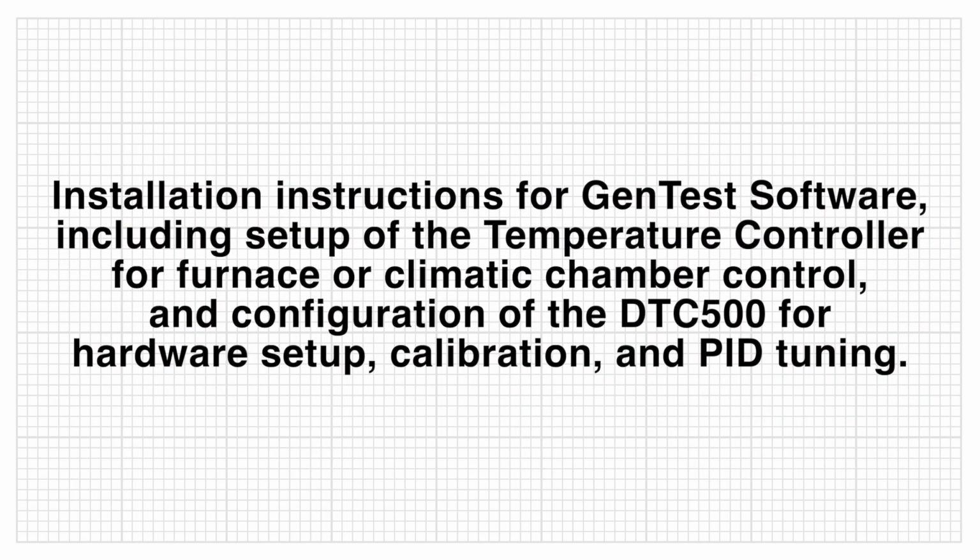Installation instructions for GenTest software, including setup of the temperature controller for furnace or climatic chamber control, and configuration of the DTC500 for hardware setup, calibration, and PID tuning.